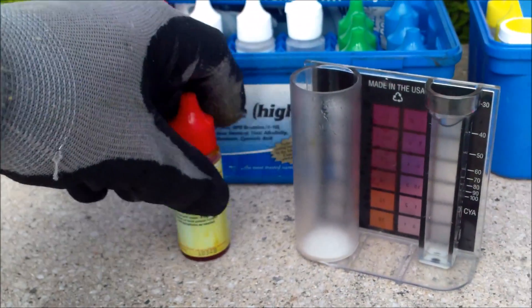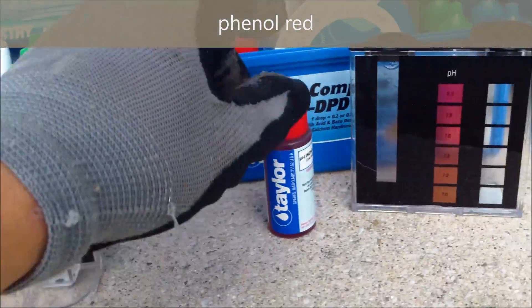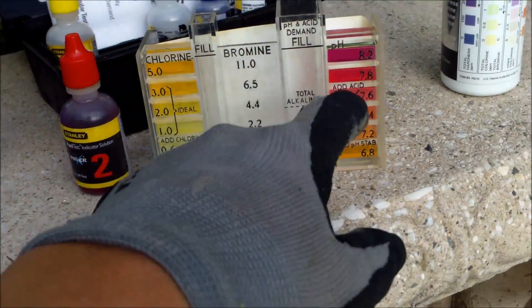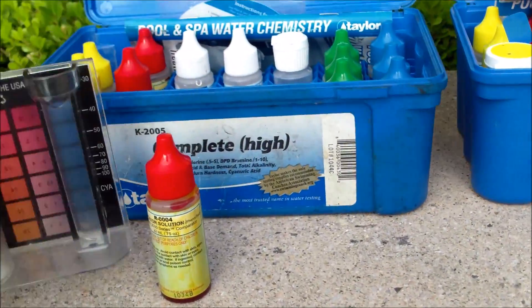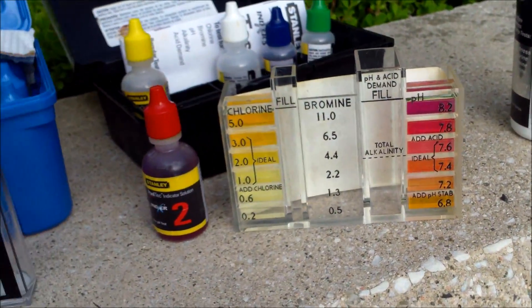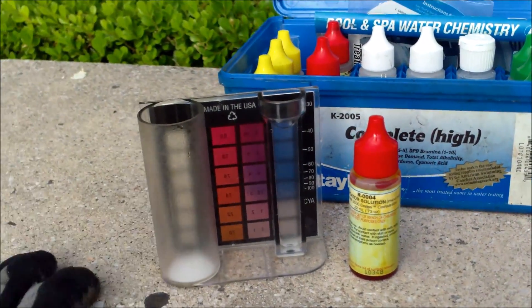As far as pH, all three kits use the same red solution. The K2005, K2006, and the 5-way test kit all use that indicator, and all three are very accurate with pH. The K2005 and K2006 also do an acid demand test, and the 5-in-1 test kit does an acid demand test as well. What the 5-in-1 doesn't do is a base demand — the K2006 and K2005 also do a base demand for you.